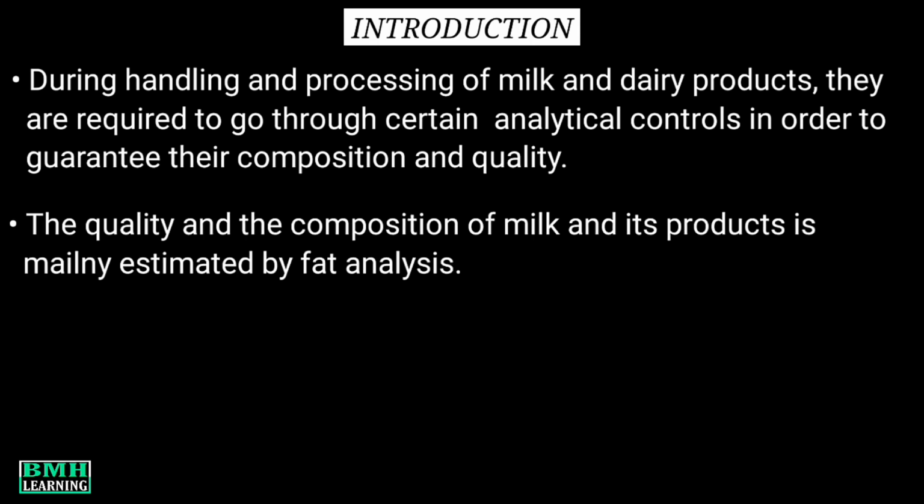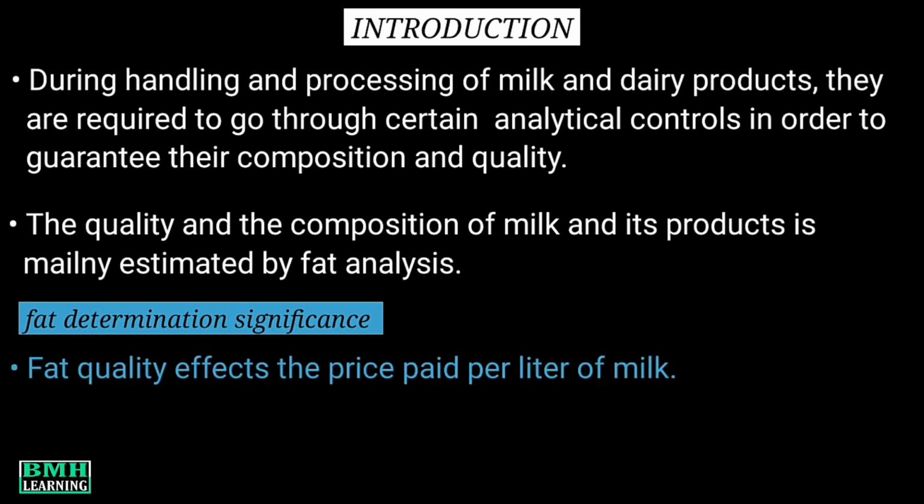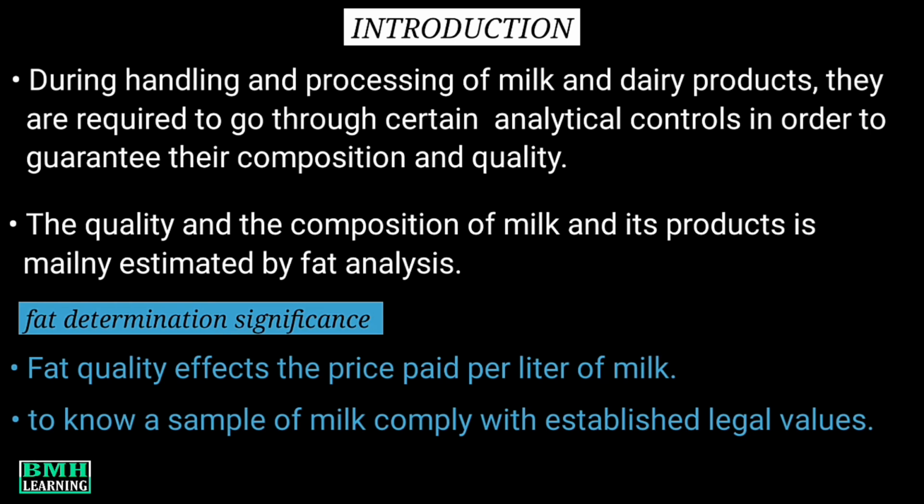The quality and the composition of milk and its products is mainly estimated by fat analysis, where we check the quality and quantity of fat a particular milk sample is having. Fat content determination is of immense significance because fat quality affects the price paid per liter of milk. It's very helpful in knowing if a sample of milk, or other dairy products, comply with established legal values.